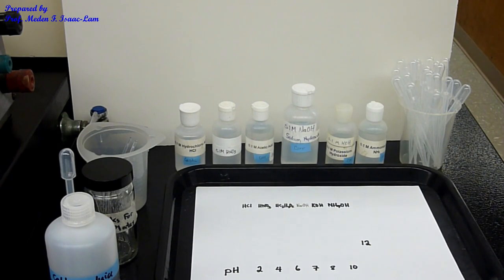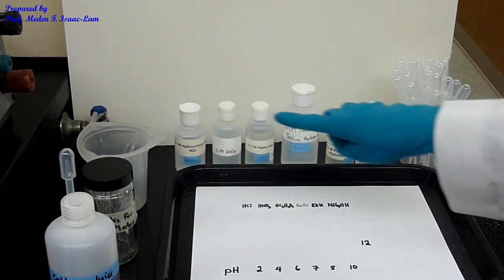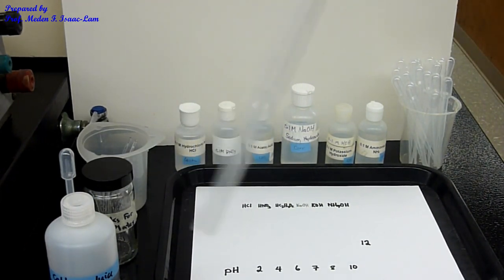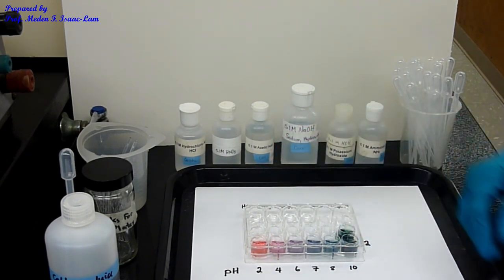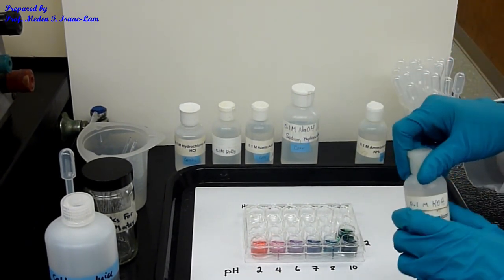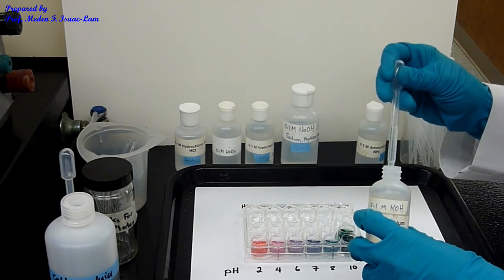Previously I had a container that serves as a dropper. However, this container is not the same, so I will use this dropper. I already put in 4 solutions: hydrochloric acid, nitric acid, acetic acid, and sodium hydroxide. I'm going to show you how I put in the potassium hydroxide. You can also do it this way. I use this pipette.